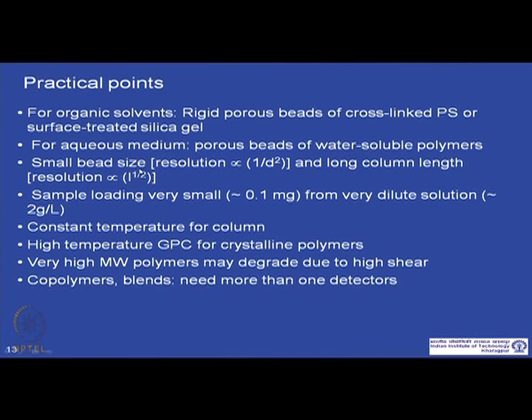The peak resolution is proportional to 1 over d square. So, basically if the bead size grows, the resolution becomes inferior. So, it is always preferable to get a smaller bead size. For example, nowadays 5 micrometer or 10 micrometer at largest is used, which actually helps in getting a better resolution.